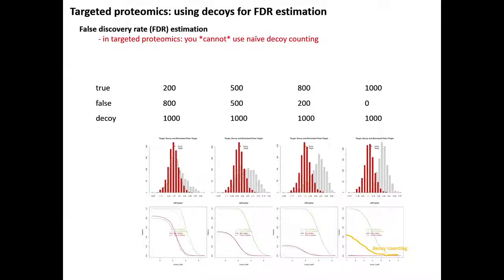Okay. And I think there was a comparison, right? Mike is talking about the tool from his lab, Percolator, and we plugged OpenSWATH recently into Percolator, so we took away mProphet and plugged it into Percolator, which is using a support vector machine. My understanding is that the results were reasonably similar, right? Is that correct, George? The algorithms are closely related except in the classifier, right? And the results are almost the same.